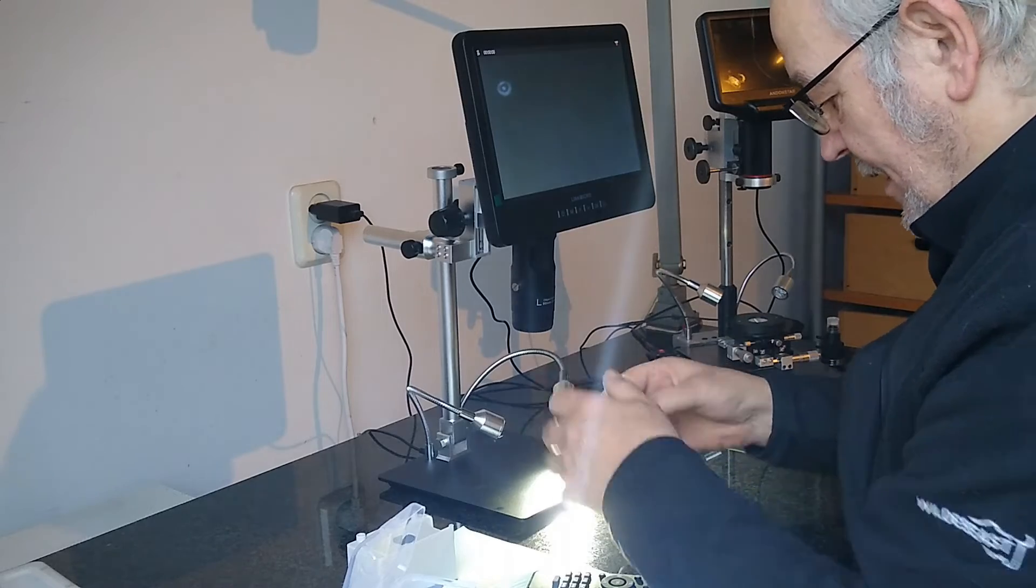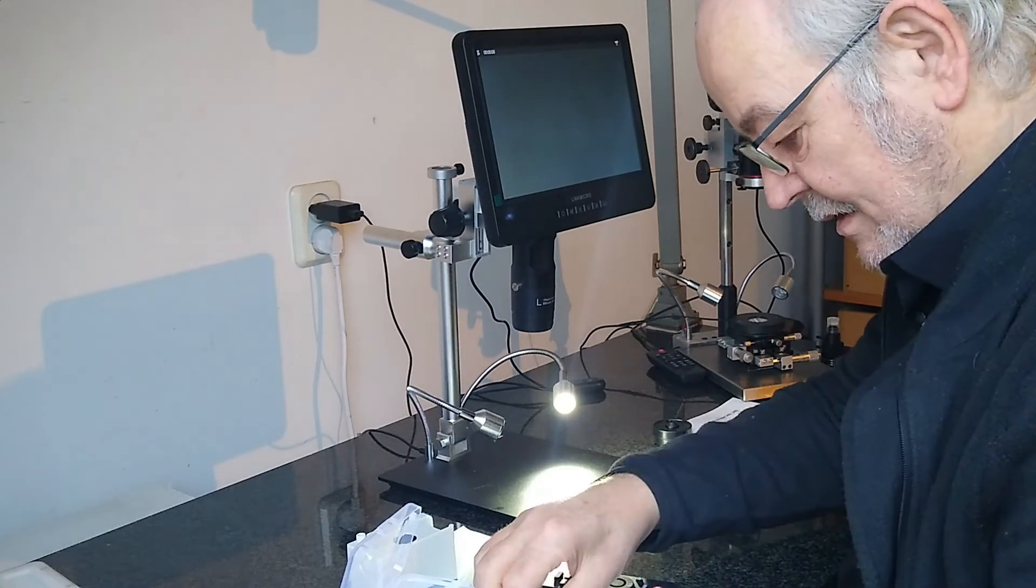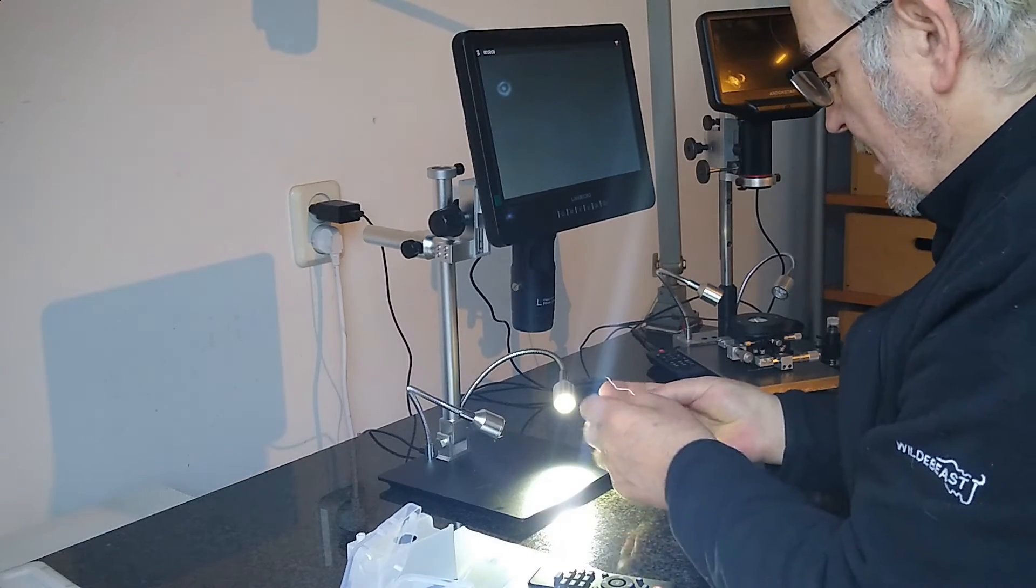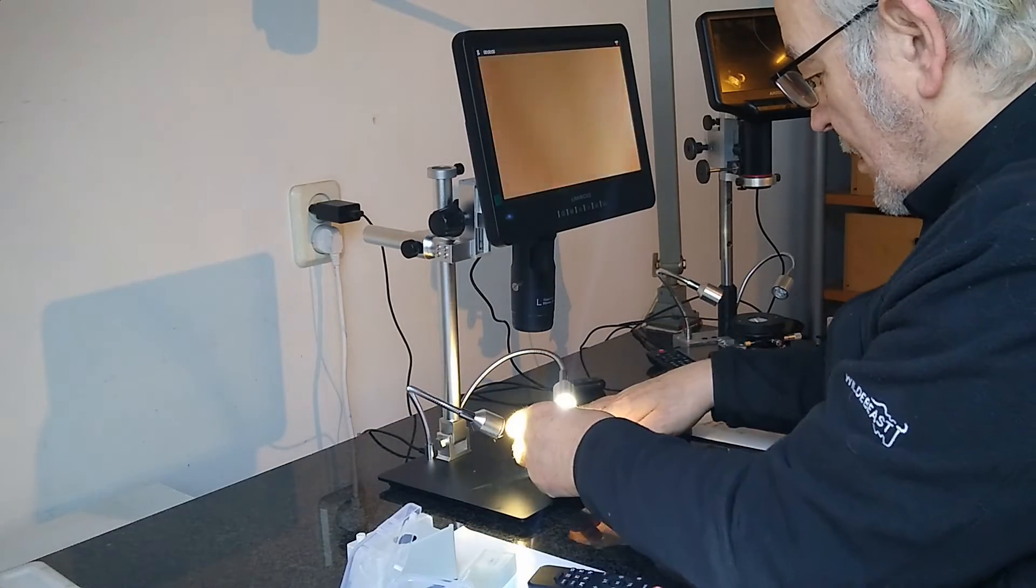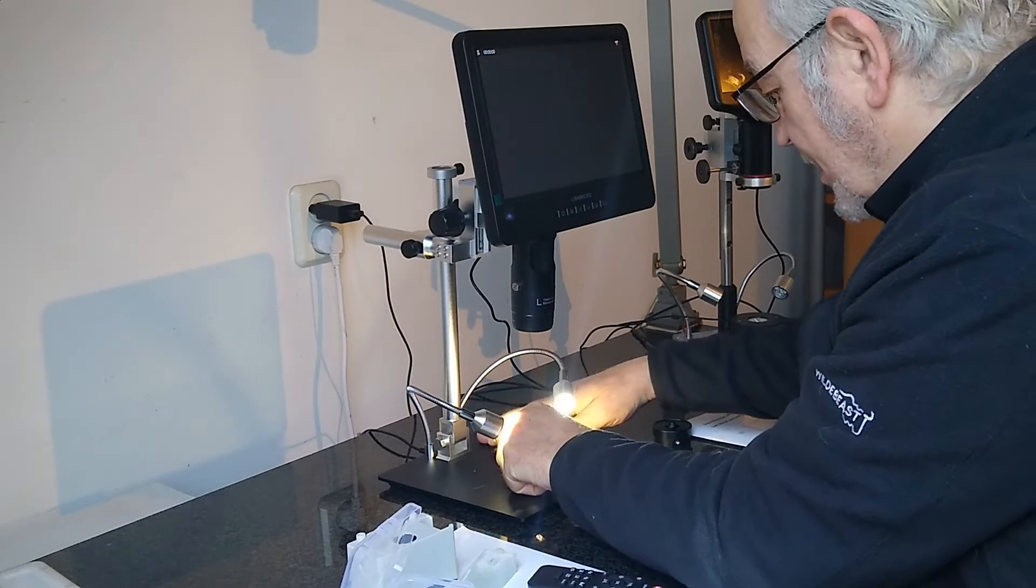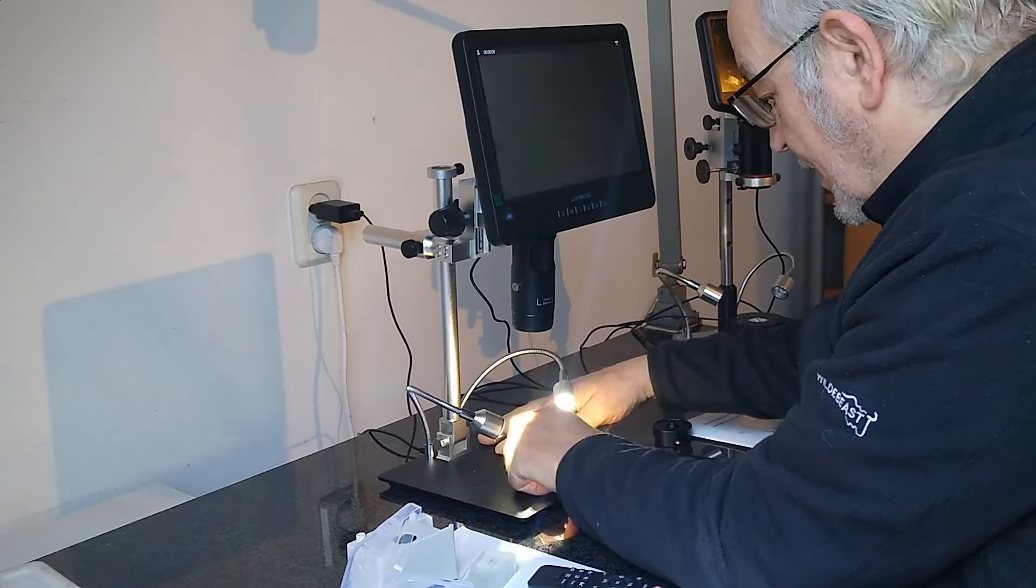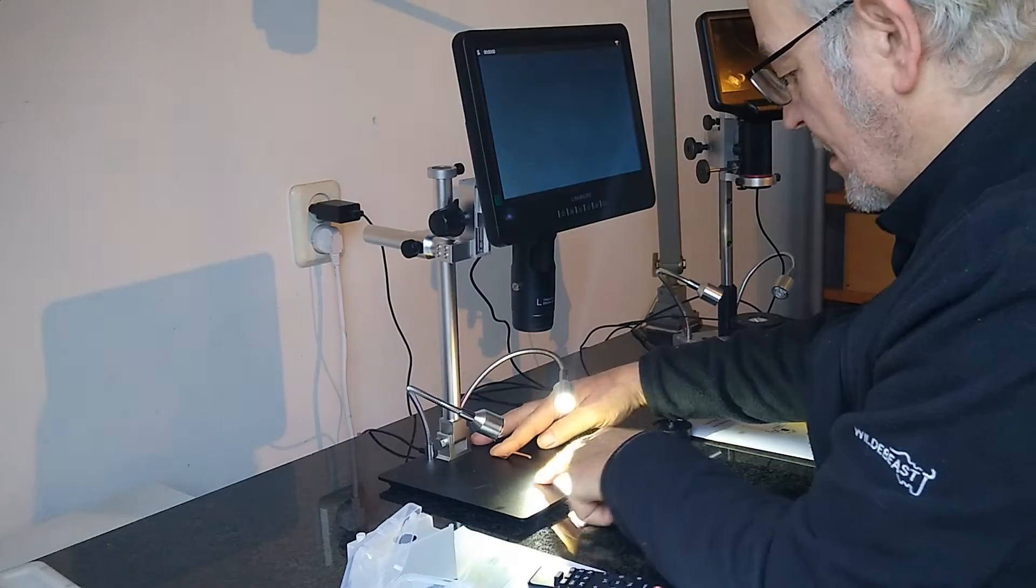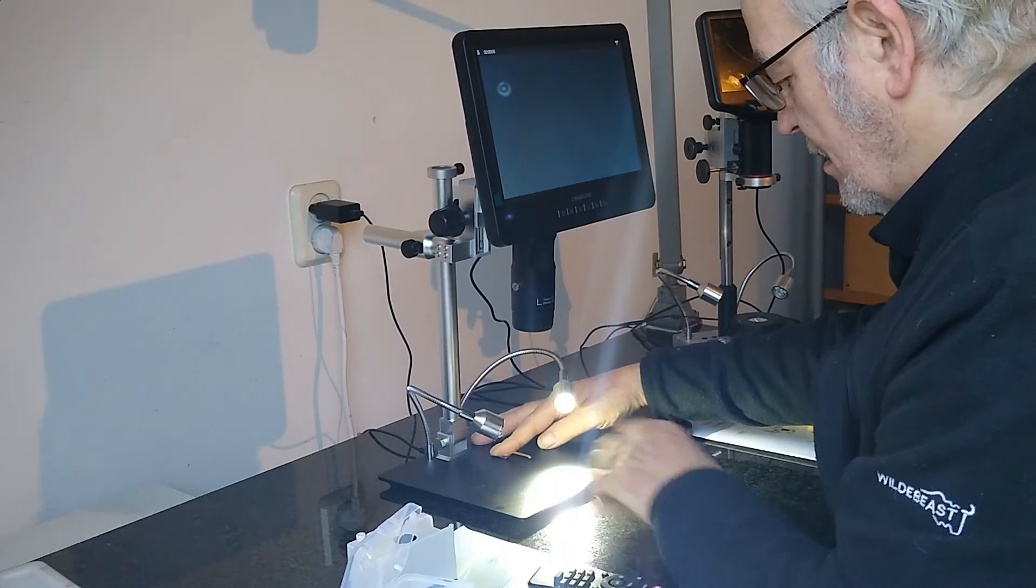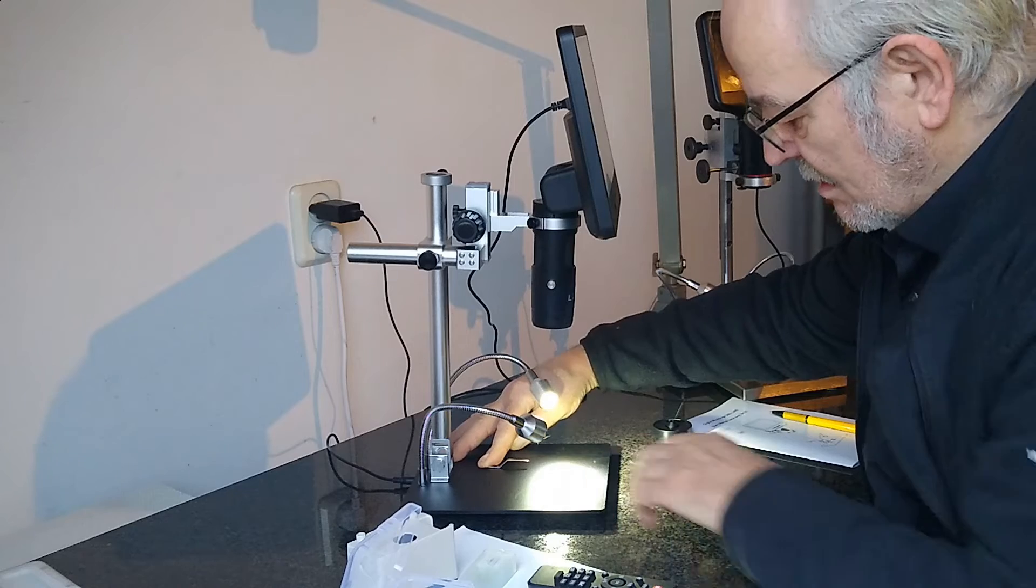It is striking that the same, now very short, gooseneck LED lights and the now really too small base plate have been used. The two spring clamps on the bottom are really too far back. Not that they were that useful on the earlier models, but it does look untidy.